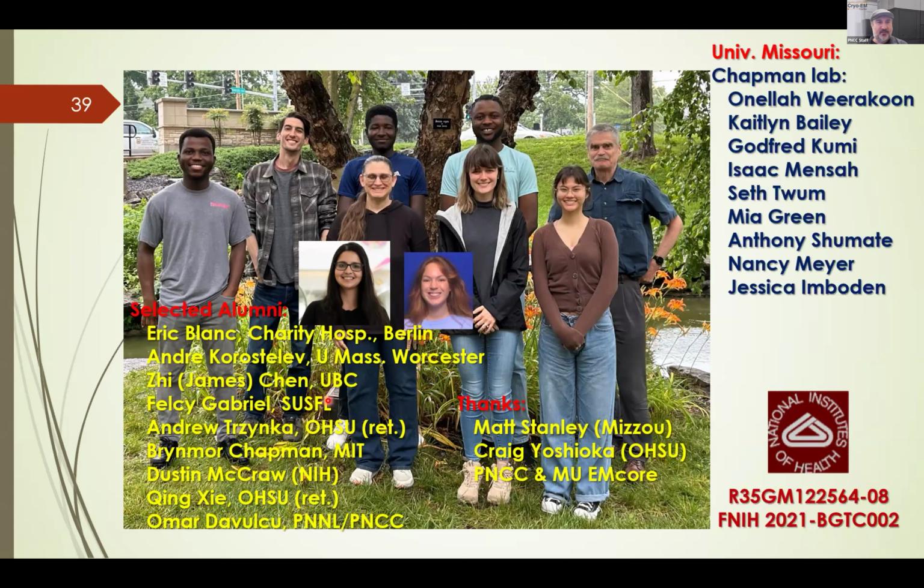So I think in all of these, you've enforced icosahedral symmetry. Do you see much difference when you relax that? Apart from our focused reconstruction, we haven't experimented other than with the cryo electron tomography.